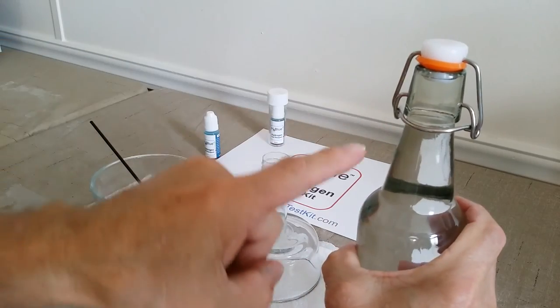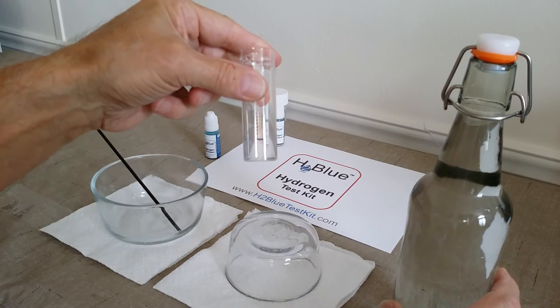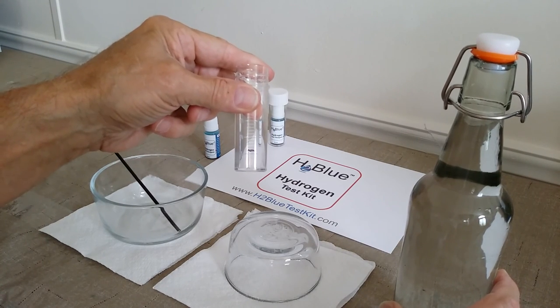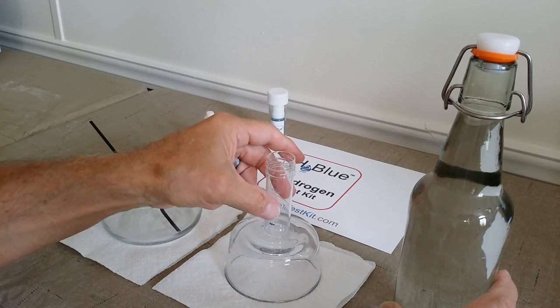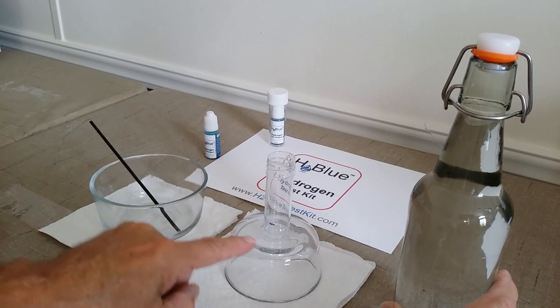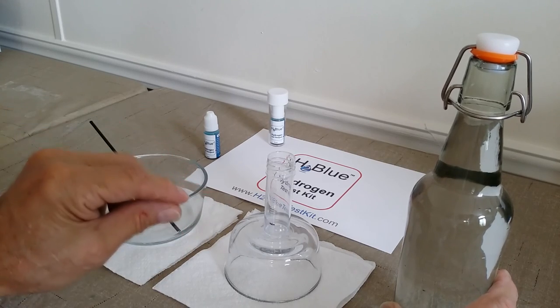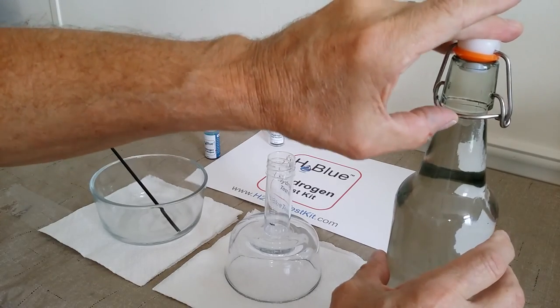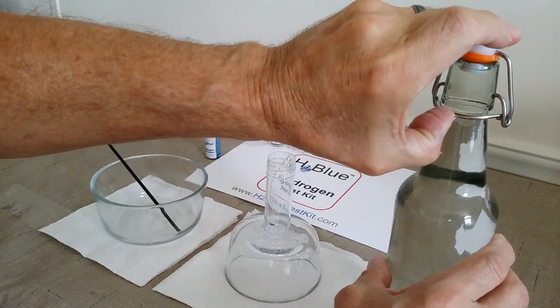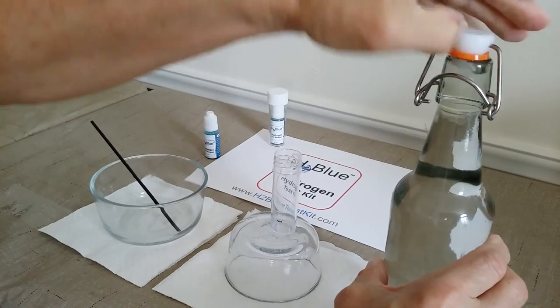And then what we're going to do is we're going to pour 6 milliliters into this graduated beaker that comes with the H2Blue. I've placed a black mark there so it makes it a little easier to see. Remember, we want to pour the level until the bottom of the curvature of the water, or the meniscus, is at the top of that mark. And we don't want to waste a lot of time. We want to move quickly because hydrogen gas is escaping pretty rapidly.